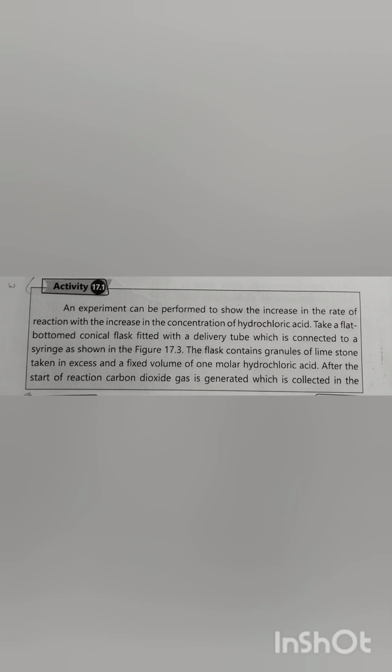This experiment practically demonstrates how increasing the concentration of hydrochloric acid increases the overall rate of reaction when it reacts with calcium carbonate or limestone. So let's see the reaction activity further.